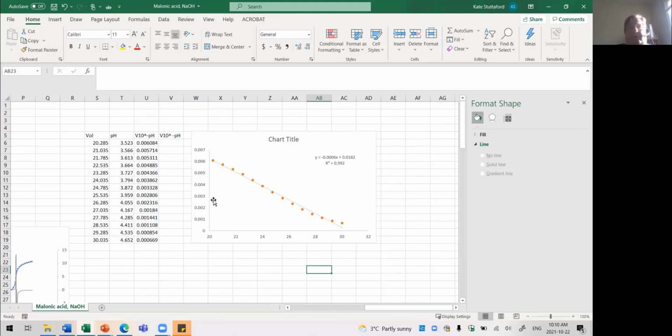linear regression. And if you look closely at this data, you'll see it's actually giving you a wave here. So you can see it's going above the line and then crossing the line and coming below the line. So not all of these points are actually in the linear portion. And so this is where this extra column comes in handy, because I'm going to move points out of this series and into the other series. And it's really easy. I'm just going to drag it over here.